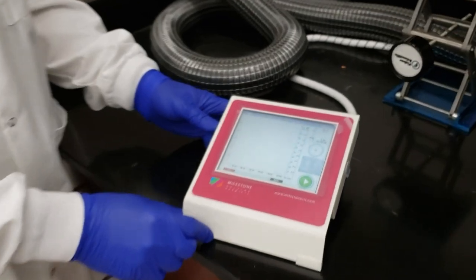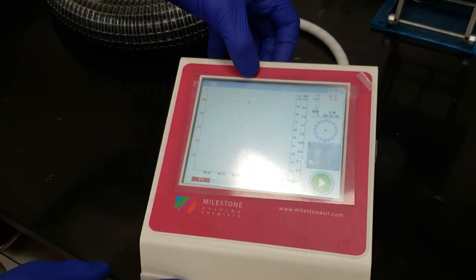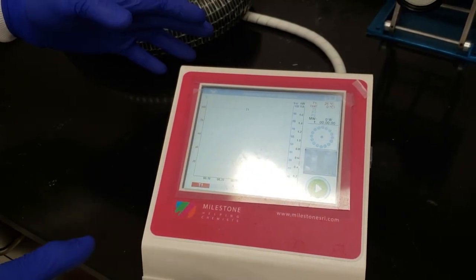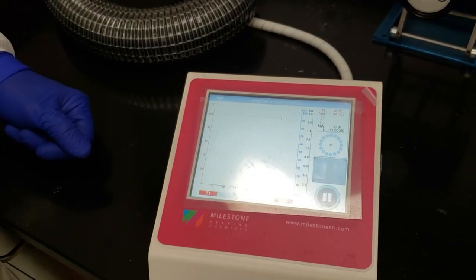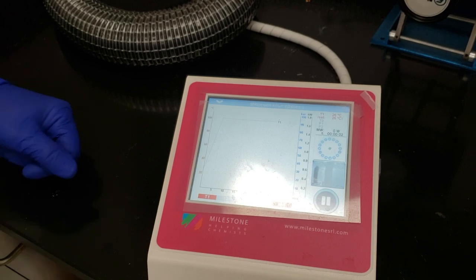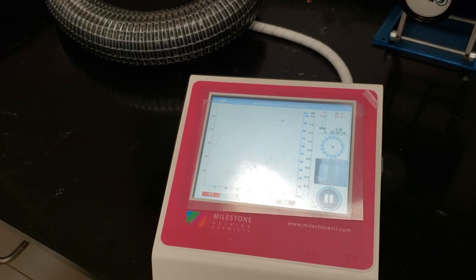Come over here to the control module. We're already set up for our Williamson ether synthesis. All of our parameters are in place. I'm going to hit go, and we'll check back in once our reflux is finished.